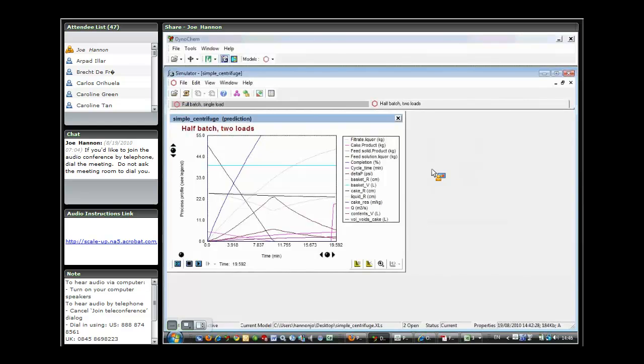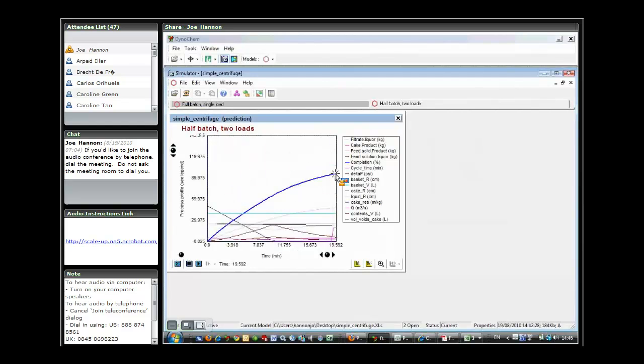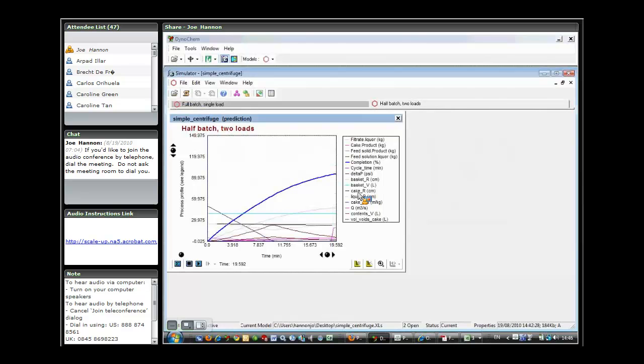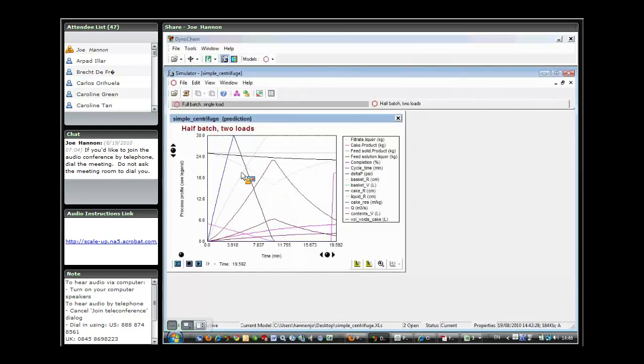Again here, if we just look at the same kinds of variables, feed solid product, we can see that we charge all of the material in the 10 minutes. If we look at completion, we can see that all that material essentially has become part of the cake. And if we look at liquid radius, we'll see here that we do build up a certain radius of liquid. We're feeding much faster, but we don't come anywhere near filling the basket, even with a feed time of 10 minutes.